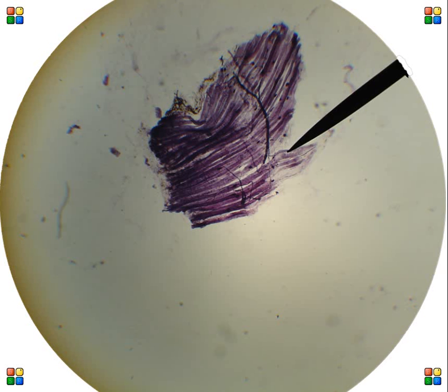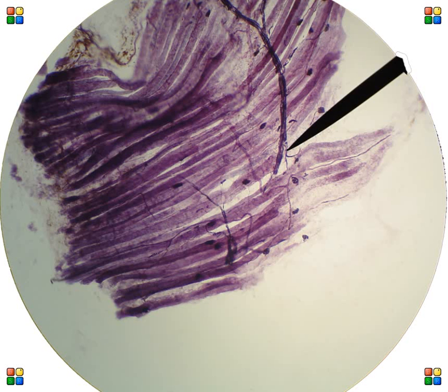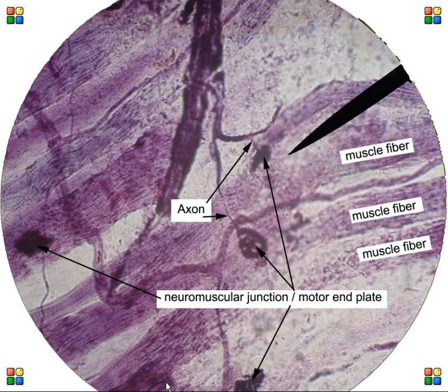Again, with the slides showing the same basic thing but from a different company, so the staining is different. Neuromuscular junction, axon to a motor neuron. Let's go to a high magnification label and you can see again, neuromuscular junction, axon and so on.